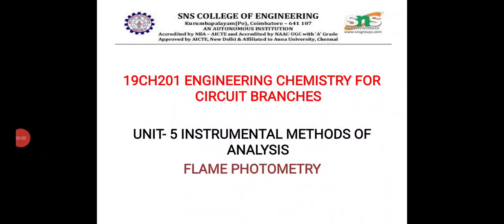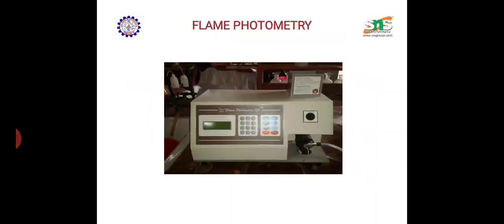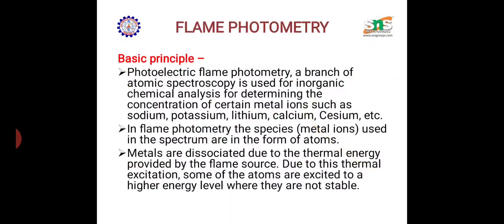Yes, in this session, we are going to learn about flame photometry, the instrumental method of analysis. It's an instrument you have seen in the laboratory. So, what's the basic principle behind flame photometry?